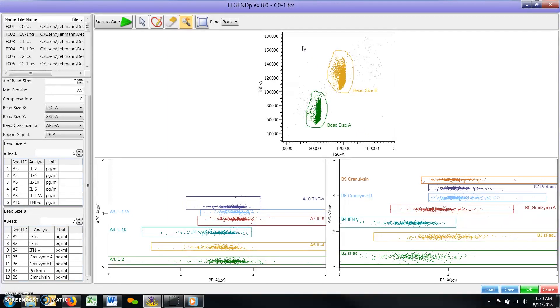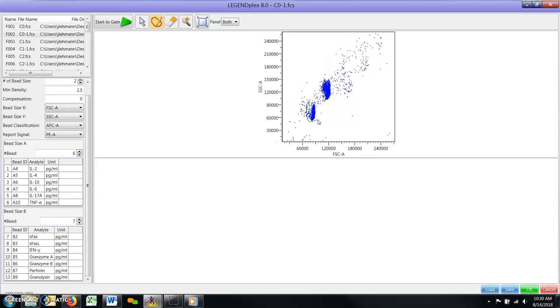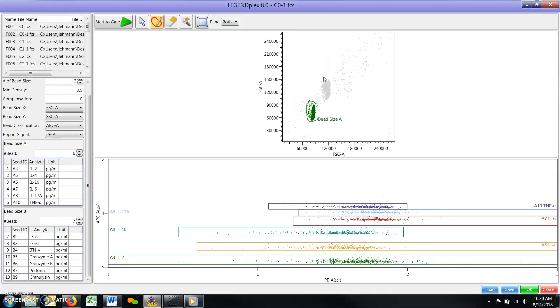Any magnification can be reset to default by clicking the reset range button to the right of the magnifier. After you draw the A and B bead gates, the software will automatically attempt to gate the bead IDs in the APC versus PE scatter plots below the sizing plot.